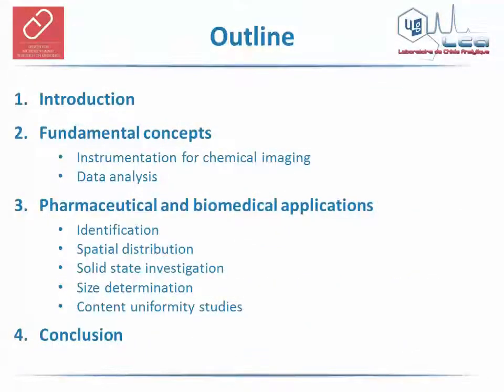The outline of the presentation will be based on 4 parts. The first 2 parts will allow to set the scene of hyperspectral imaging and fundamental concepts of Raman spectroscopy, instrumentation, and data analysis. The third part will be dedicated to pharmaceutical and biomedical applications in order to illustrate the power and the suitability of this technique. Finally, I will end the presentation by drawing some conclusions.